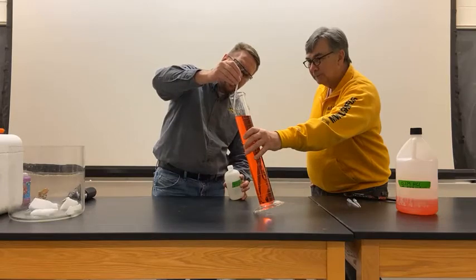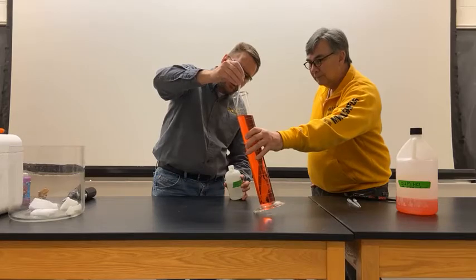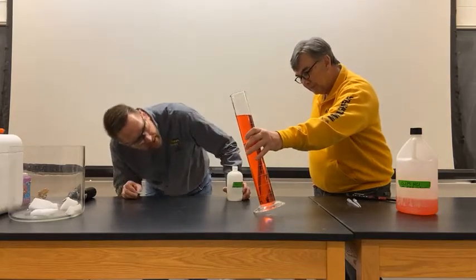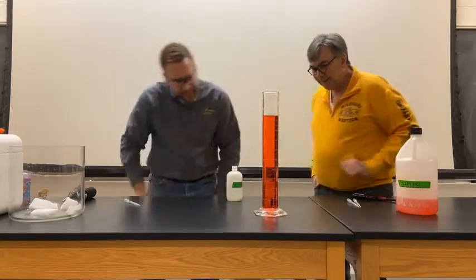Now I will tell you that normally this is an experiment or a demonstration that Dr. Lorimer in our department does, and he does it very, very well. So we're hoping that I can do it reasonably well for you to see.